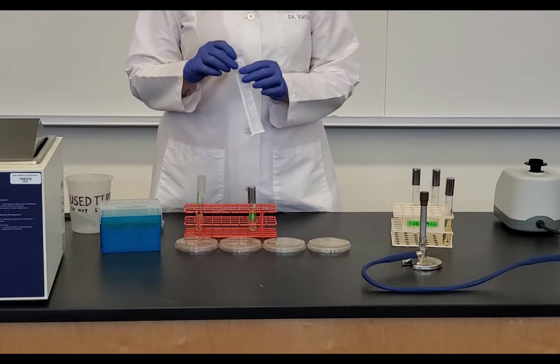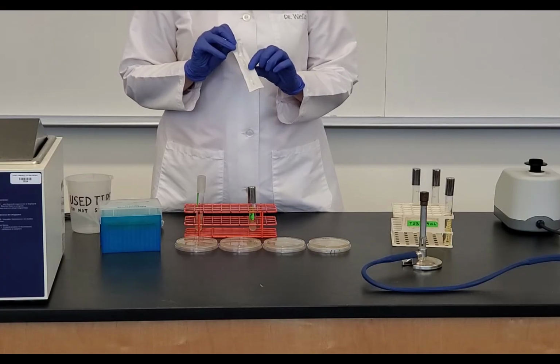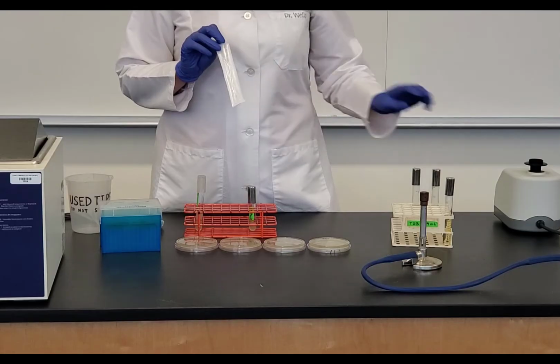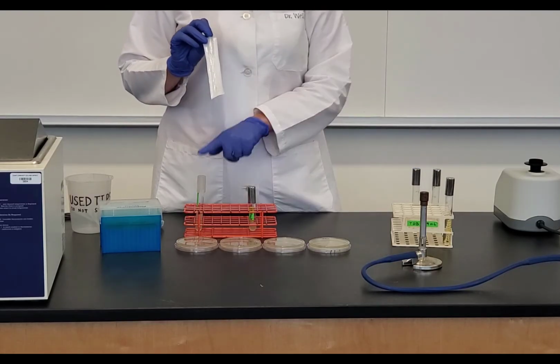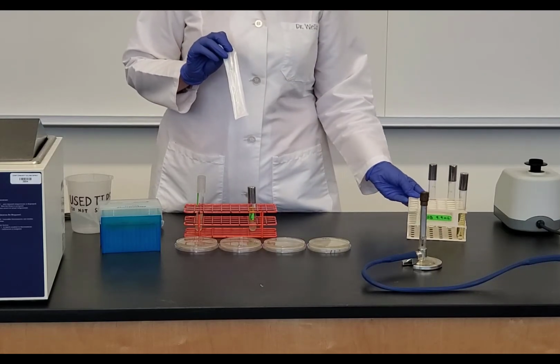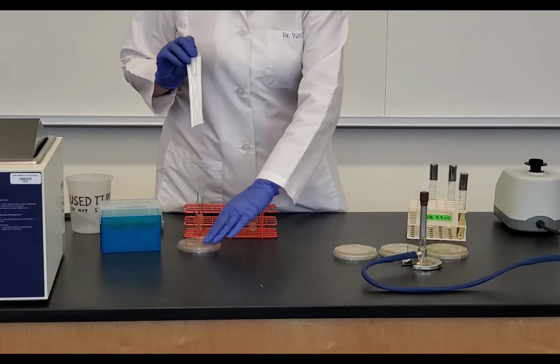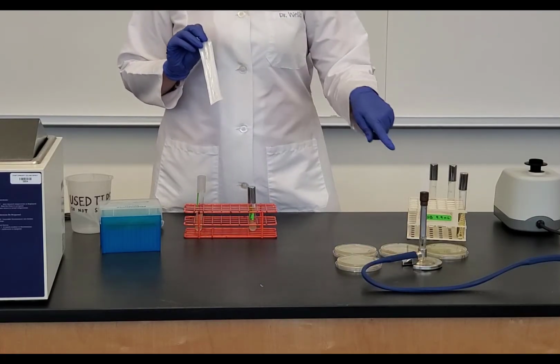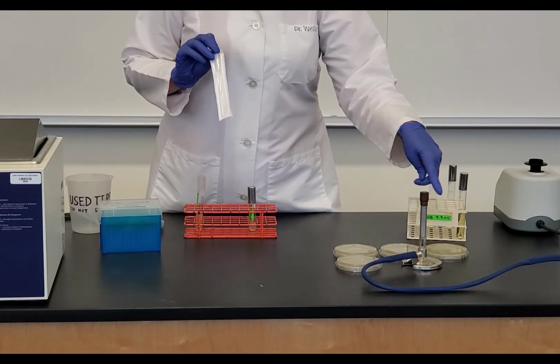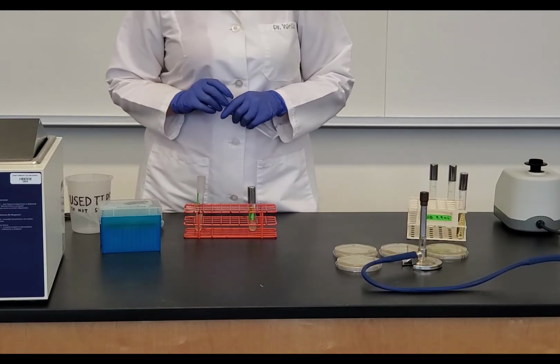These are 1 milliliter transfer pipettes, and I need to transfer half a milliliter of the E. coli to the melted agar deep. So I'm going to transfer both my phage and my E. coli to a melted agar deep, and then I'm going to pour it. Now, remember that when I pour plates, my sterile field is around my flame. If things fall and hit the flame, it's going to help keep it sterile. So I'm going to move those close to my flame.